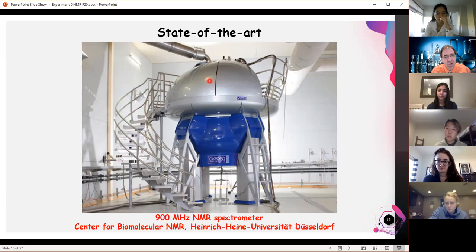But there's also this beam that's coming out here. This beam is coming out here because this magnet is actually large enough that it can start to mess with the nuclei in you. So it's not actually safe for someone to keep going in and out of this magnetic field all the time. So there's an auto sampler. It puts the sample in for you so you don't have to walk in on a regular basis. It's kind of a nifty thing that we can see.